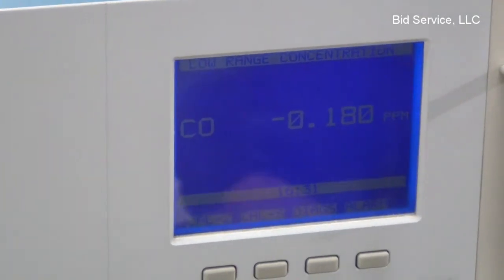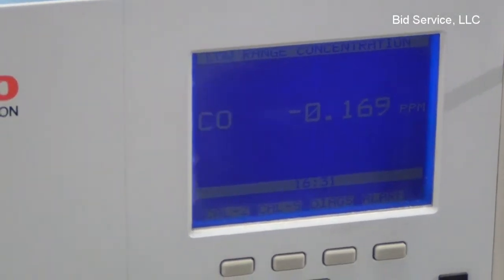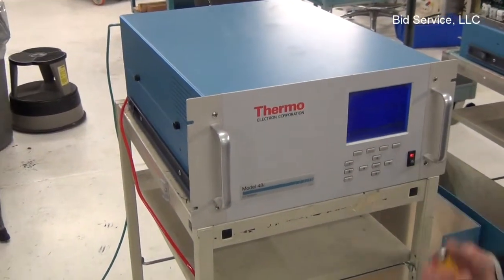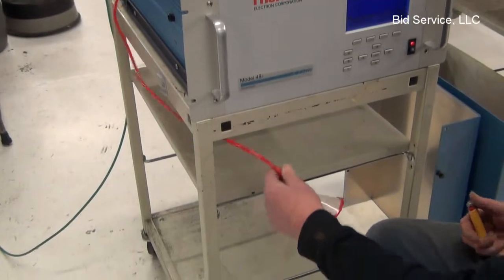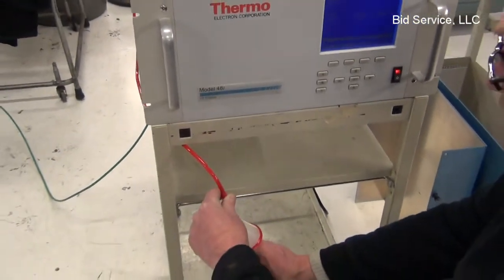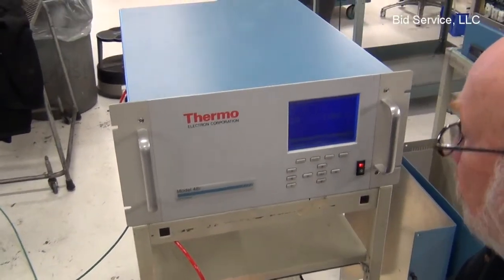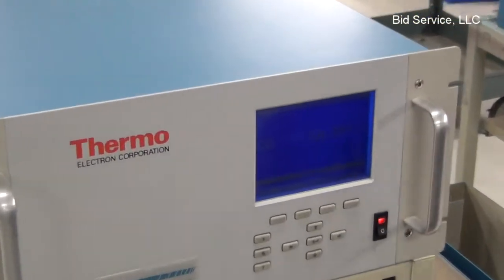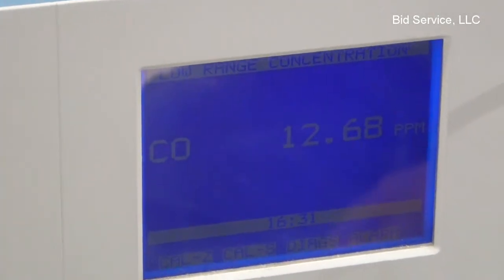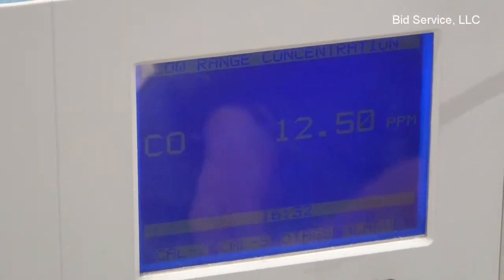To demonstrate the sensitivity and accuracy, burning anything will create carbon monoxide, including a simple butane lighter. So we have a sampling port here, and I'll just hold the butane lighter on for about 5 seconds. And immediately the instrument reacts to even a small amount of carbon monoxide produced by the lighter.